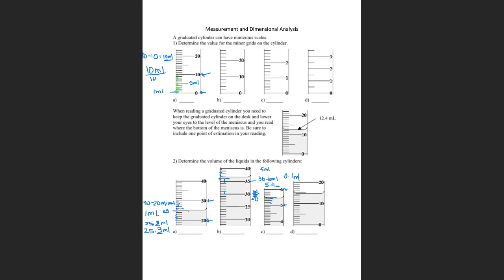When I'm looking at the space between 5.4 and 5.5, it looks like the meniscus is about halfway through, from where I'm standing. So that means it's a 0.05, right? Halfway through. So I'll estimate that to be 5. So reading at 5.45 milliliters.